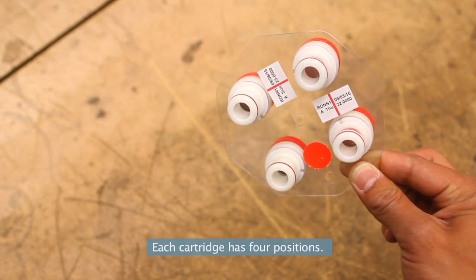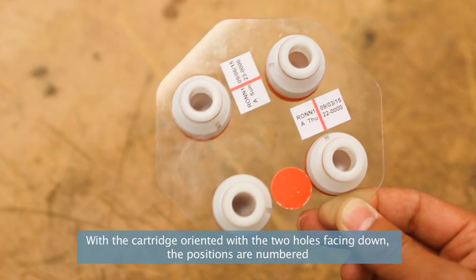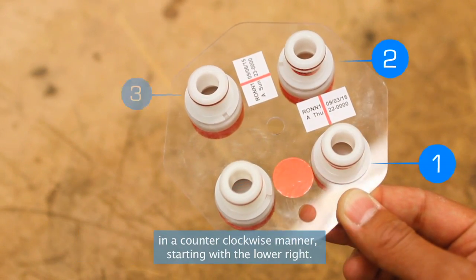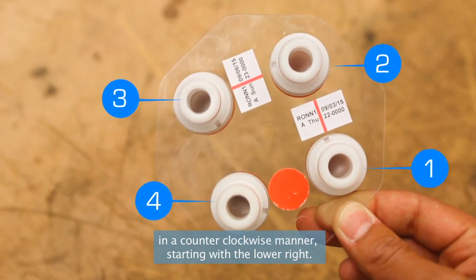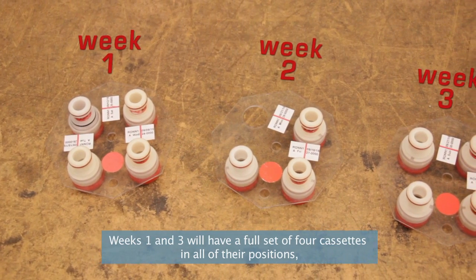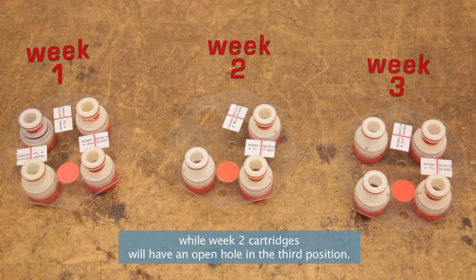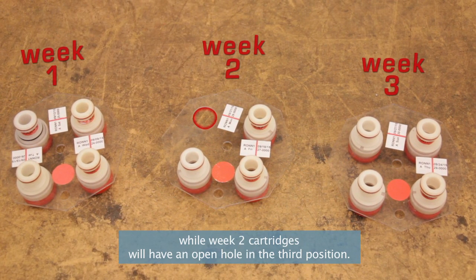Each cartridge has 4 positions. With the cartridge oriented with the 2 holes facing down, the positions are numbered in a counterclockwise manner, starting with the lower right. Weeks 1 and 3 will have a full set of 4 cassettes in all of their positions, while week 2 cartridges will have an open hole in the 3rd position.